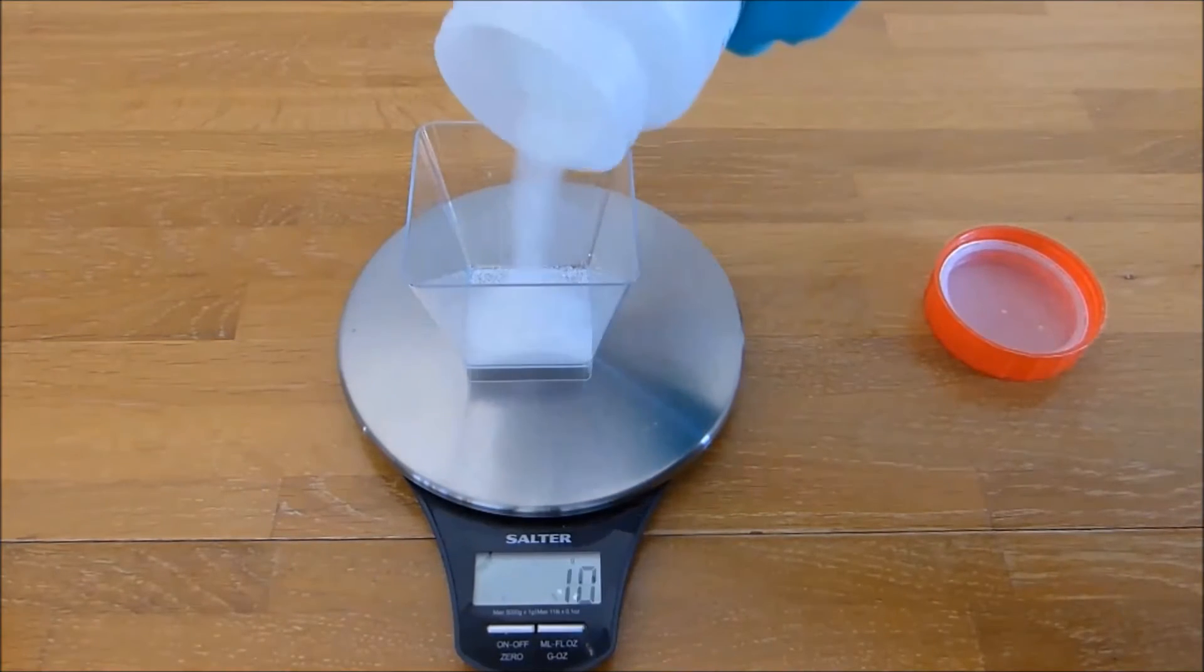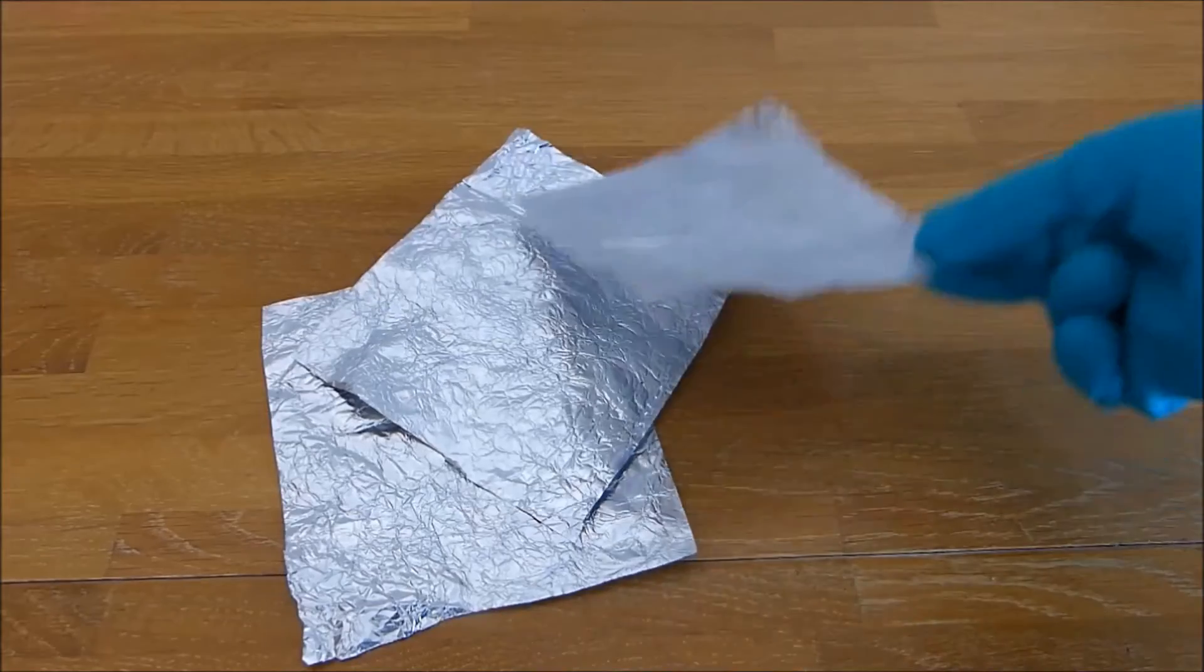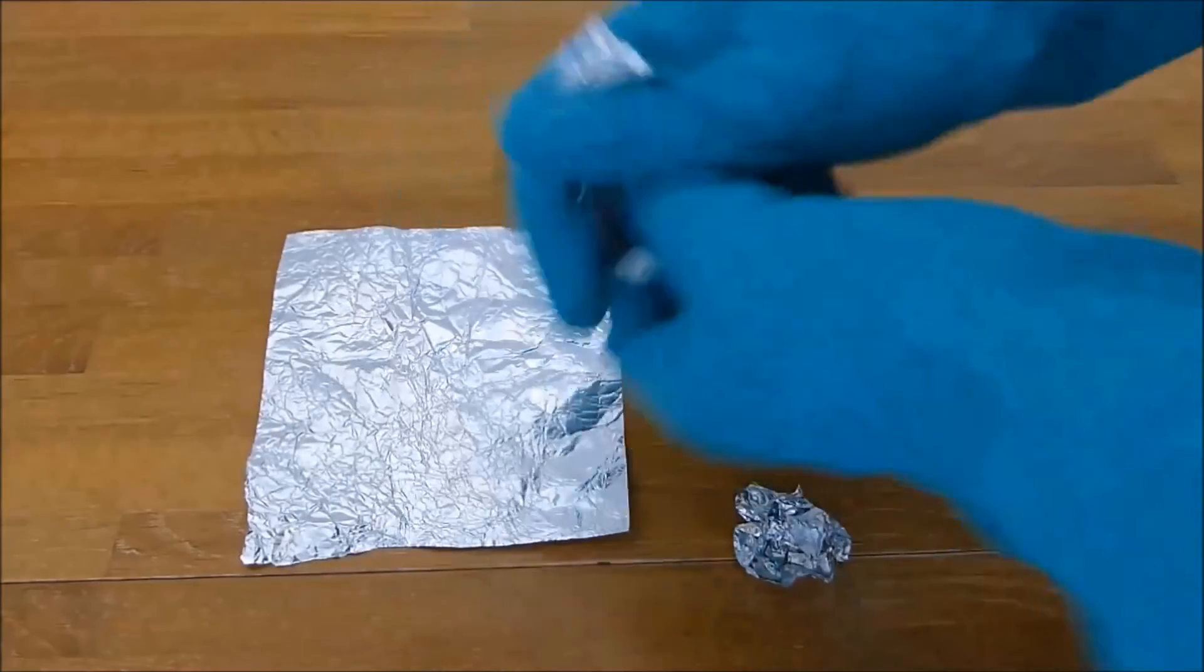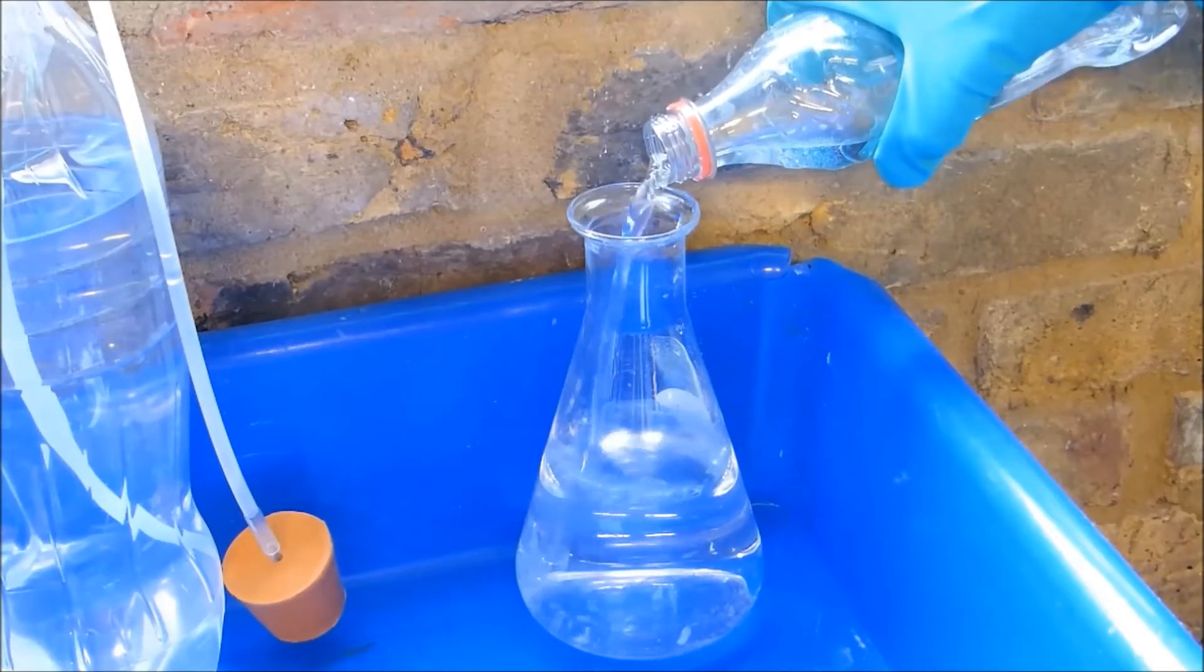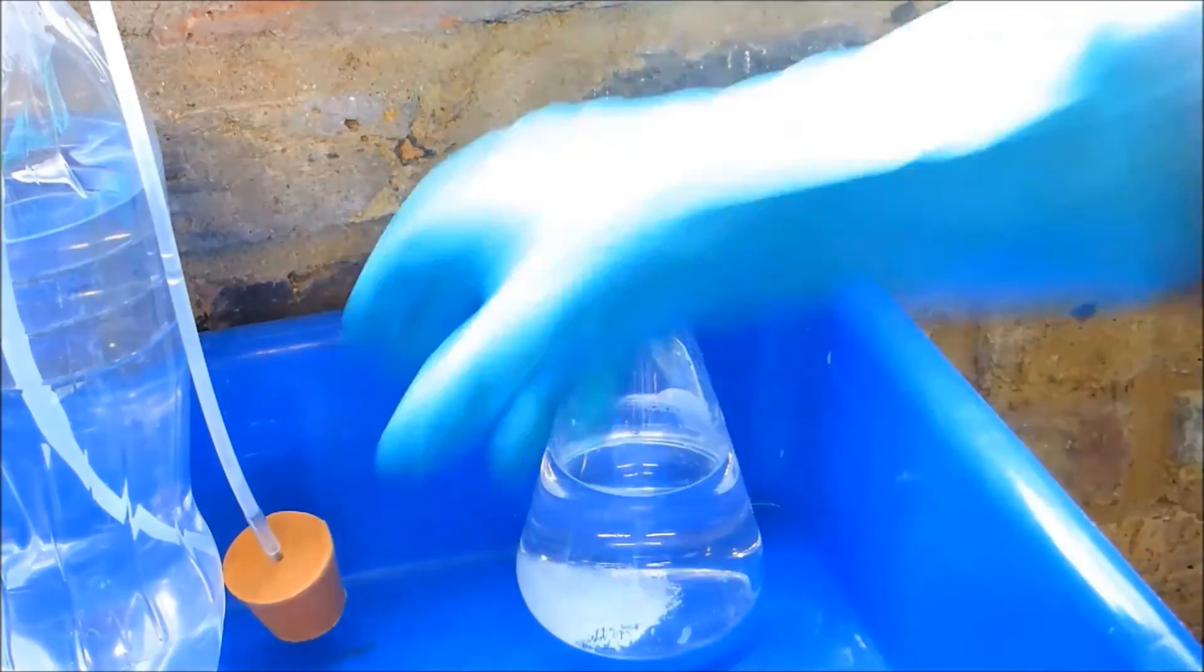I measured out 20 grams of sodium hydroxide, scrunched up some aluminium foil into balls. Then I added 400 milliliters of distilled water into the heat proof container and slowly added the sodium hydroxide.